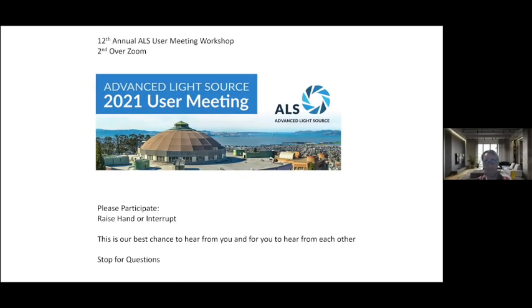All right. So I'm going to move on to small angle X-ray scattering. Just a real brief intro. I promise it won't take more than 5 minutes. And we'll move on to Mikkel's talk.